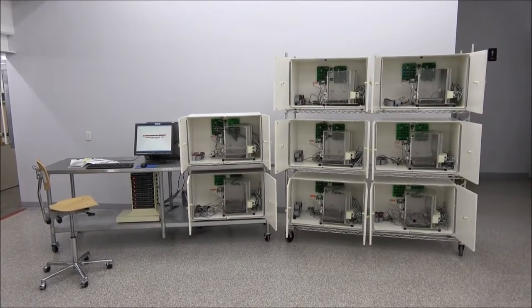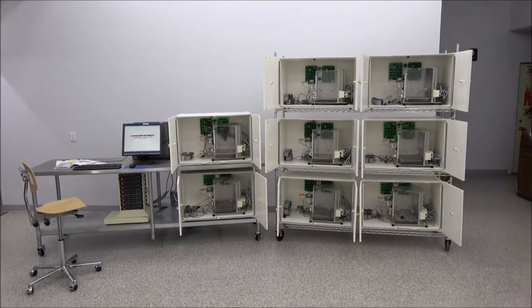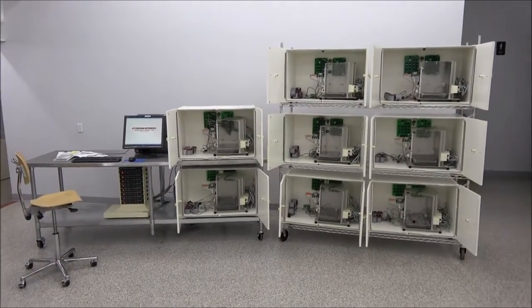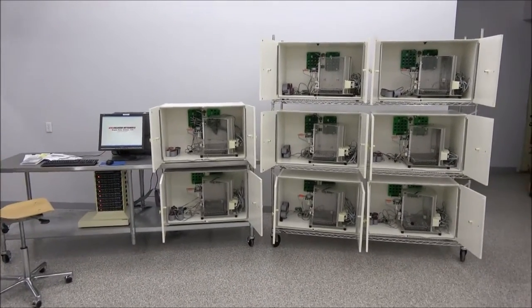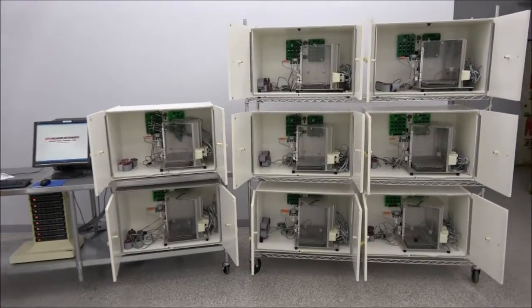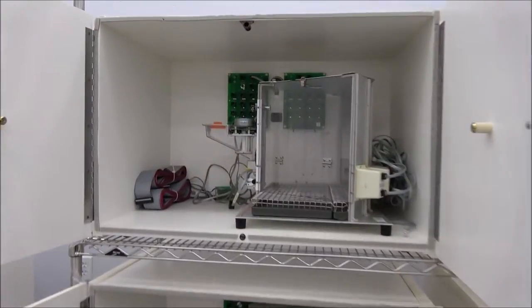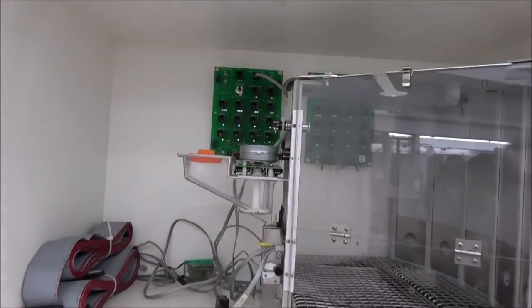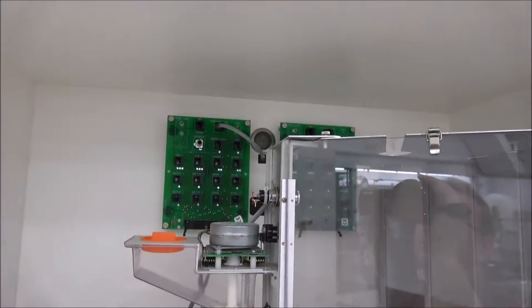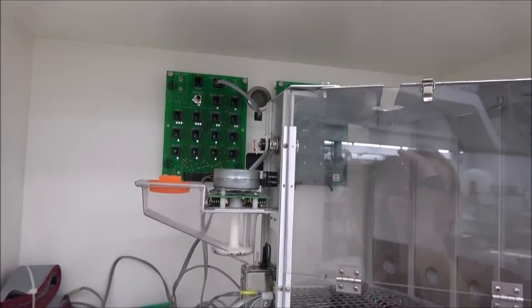It came from a reputable pharmaceutical company, and this one's a little different than the ones we've had in the past. I'm going to show you here real quick. First, I'm going to go through all of them. They're all identical chambers—there's eight in total. I'm going to show you it does have two boards in the back, so you've got a lot of connections for a lot of different inputs and outputs.